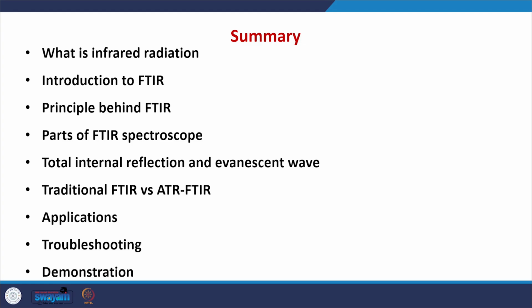As a summary, in today's lecture we learnt what infrared radiation is, what the working principle of FTIR spectroscopy is, and also what the various parts of FTIR spectroscopy are, and through practical demonstration we also learned FTIR spectroscopy in detail.